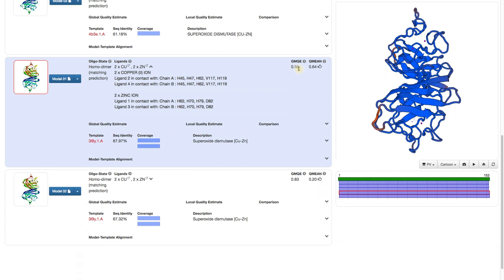The Global Model Quality Estimate is an updated version of the one shown in the template selection, because it also takes the Q-mean score into account. Now what is the Q-mean score?